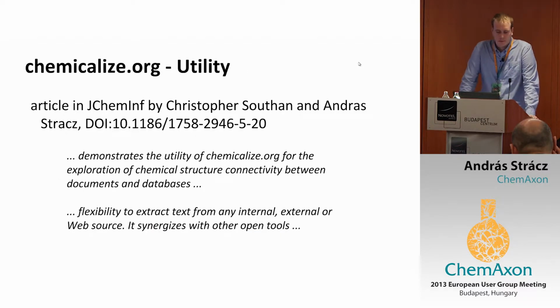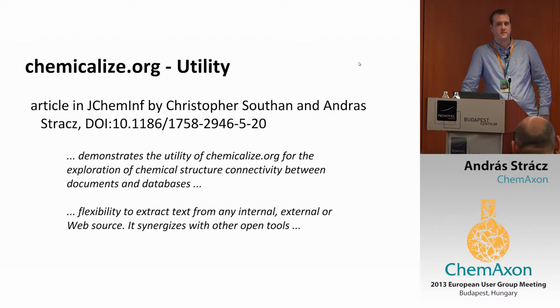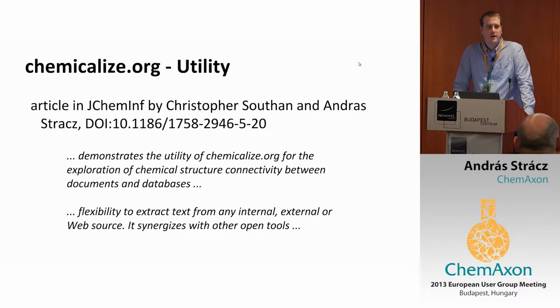As far as utility goes, with Chris Southon, who has a poster outside and has copies of it, we set out on a task to publish how useful we think this tool is.